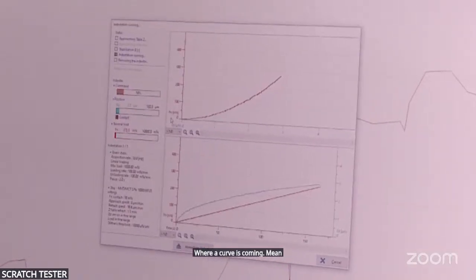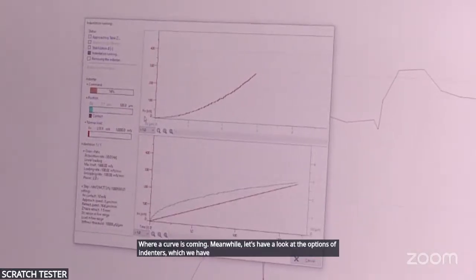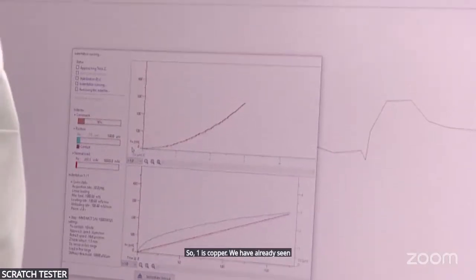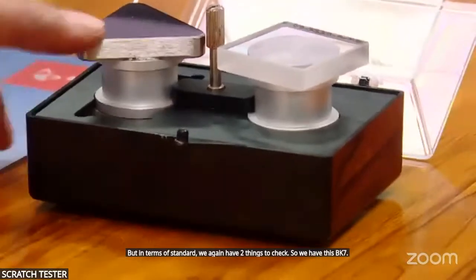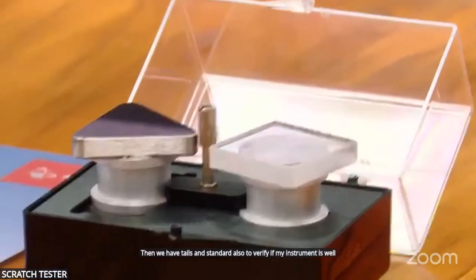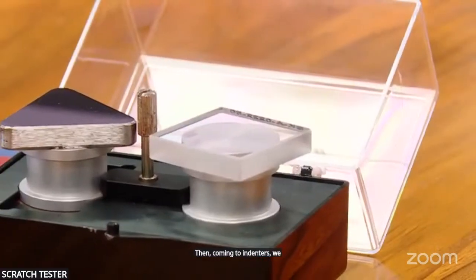Meanwhile, let's have a look at the options of indenters which we have, or say standards. So one is copper, we have already seen, it's not a standard, just a reference sample. Then we did the AlN scratch, that is again a reference sample. But in terms of standards, we again have two things to check. We have this BK7, then we have a steel standard also to verify if my instrument is well calibrated or not. Then coming to indenters, again you have multiple options.